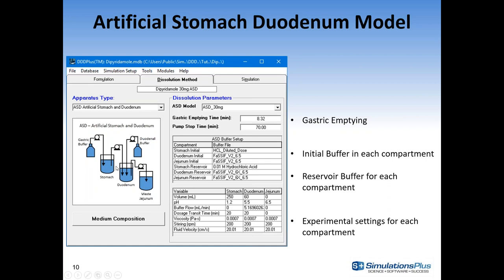In the model, you can select the initial buffer for every single compartment and specify replenishment or reservoir buffers, pumping fresh buffer into the stomach, duodenum, or waste compartment. Typically you would pump in two or four times concentrated FaSSIF in the duodenum to counteract acid changes from gastric emptying. You can set initial volumes, use constant pH mode to set the pHs of each compartment, or let the software dynamically calculate the concentration of all buffers and salts and calculate the pH using equilibrium equations.